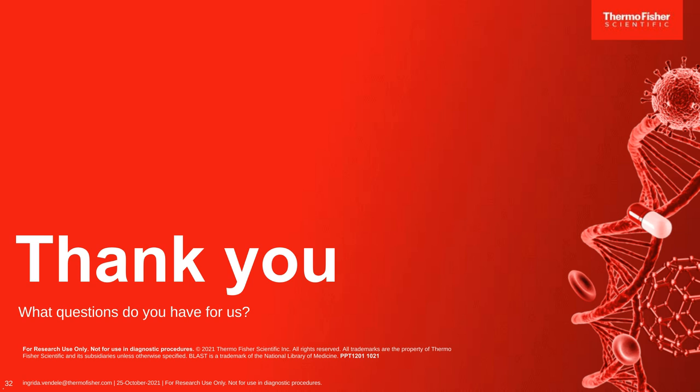Right, that's a great question. We also want to note that being very careful with how you handle the SARS-CoV-2 virus is paramount for any research. So here, what we're suggesting is that the user inactivate the SARS-CoV-2 virus and lyse it using a combination of a 95-degree heat step in the presence of a reducing agent. The Colorimetric ReadiLAMP user guide has this protocol incorporated. It only adds 5 minutes to your overall workflow, and it can help you and your lab be safer and be less exposed to the virus.